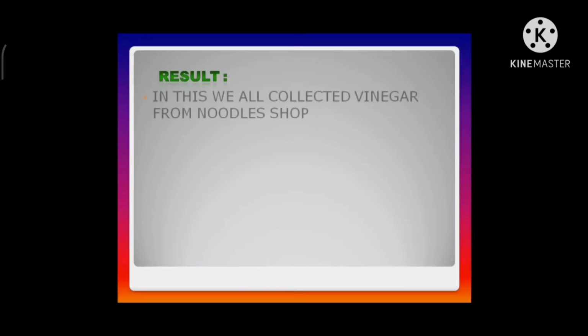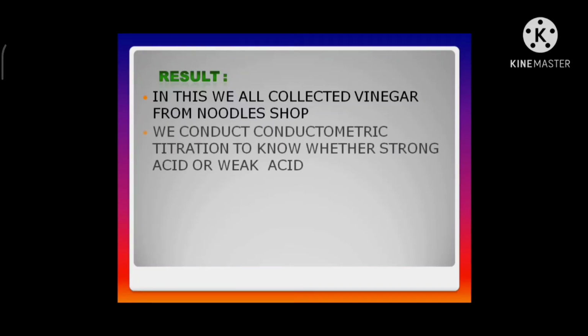In this experiment, we collected the vinegar solution from a noodle shop. We conducted conductometric titration to know whether it is a strong acid or weak acid. By the graph we plotted, we finally confirmed the strong acidic nature of the vinegar they used.